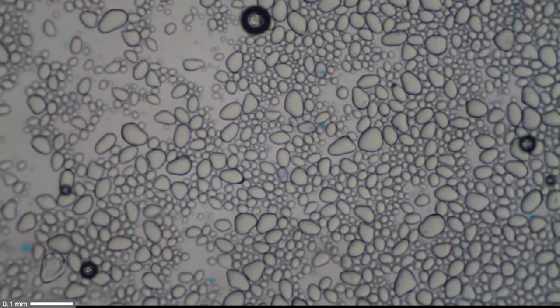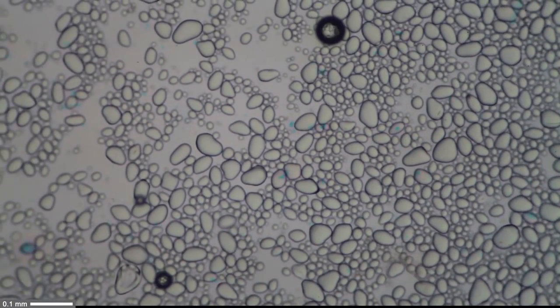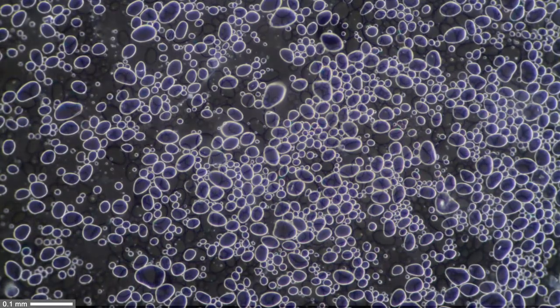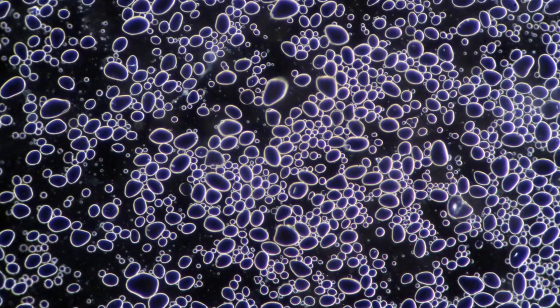Just for comparison this is without any filter at all, basically in bright field. You still see the starch grains of course but the contrast is not quite as nice looking as when you have a very nice contrast between the starch grains and the background.